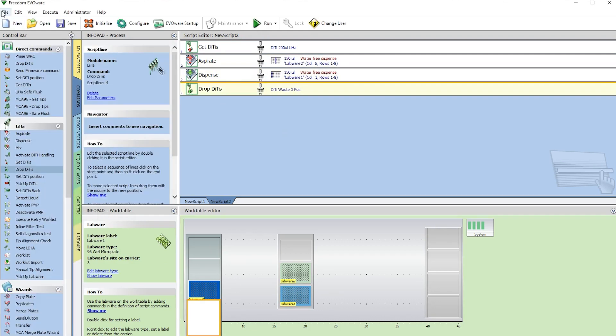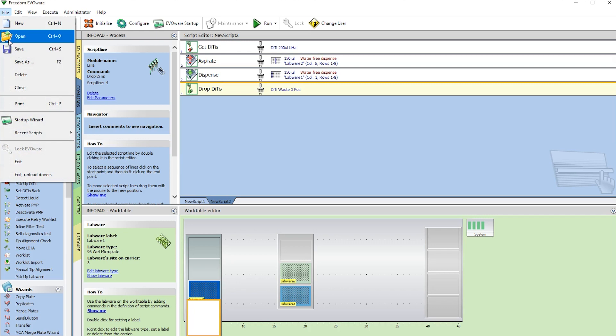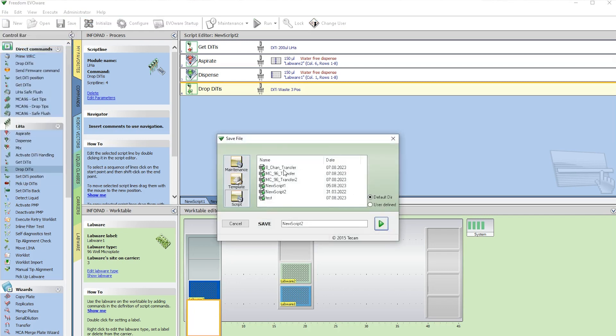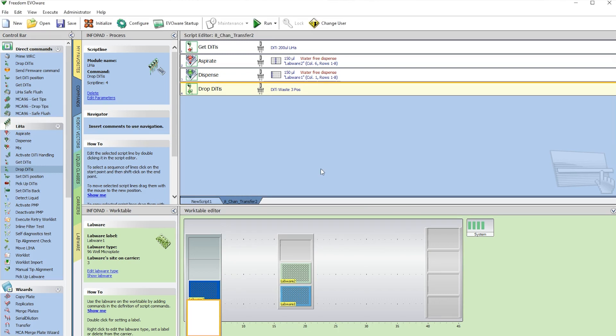To save it, select File, Save, give it a name, 8-channel transfer. And now we're ready to press Run.